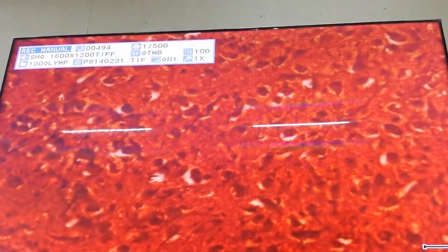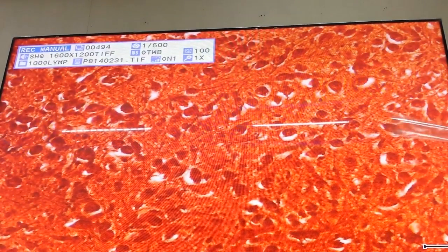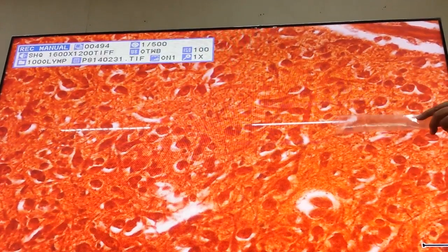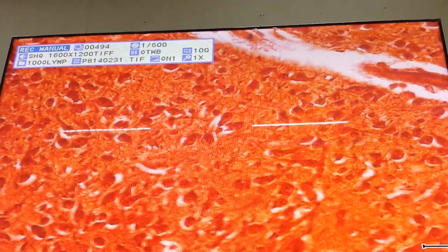So this would be the molecular, and then these are the pyramidal and granular layer. A little bit difficult to identify with this particular stain. It primarily focuses on the appearances. So you have large cells as the pyramidal cells, but it's difficult to identify the granule cells. Smaller round cells will be seen in the internal granular.